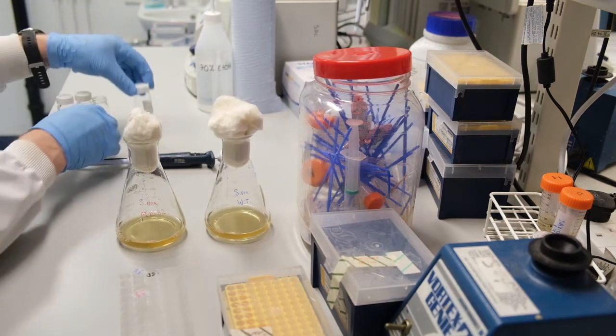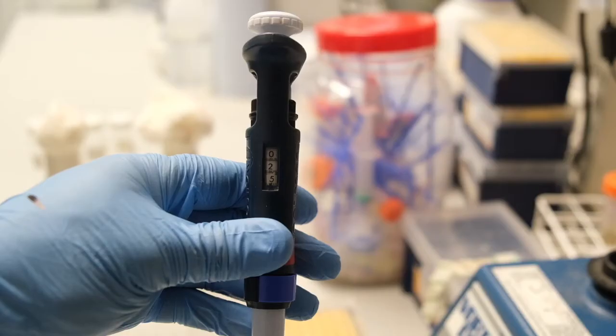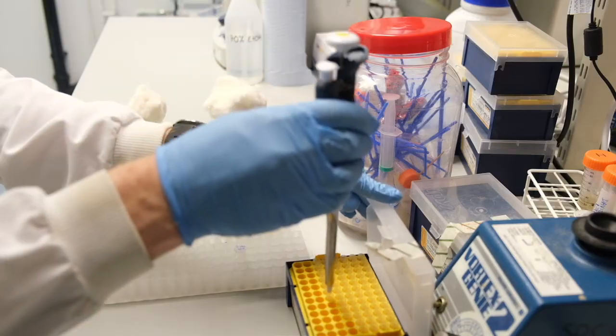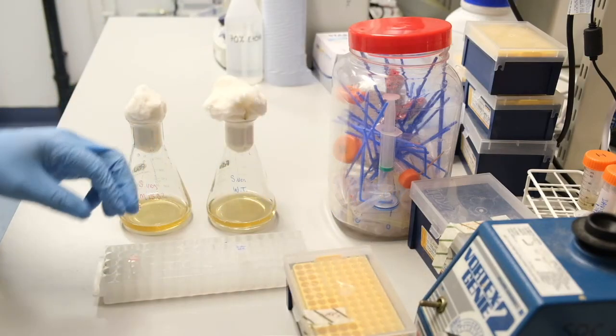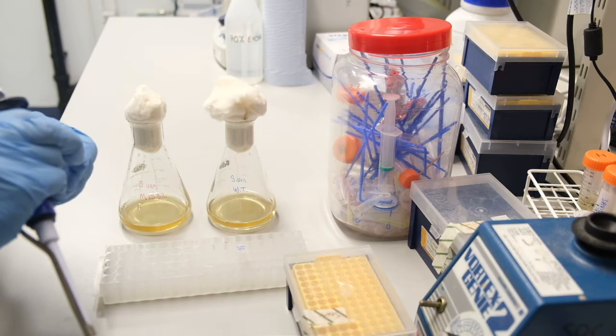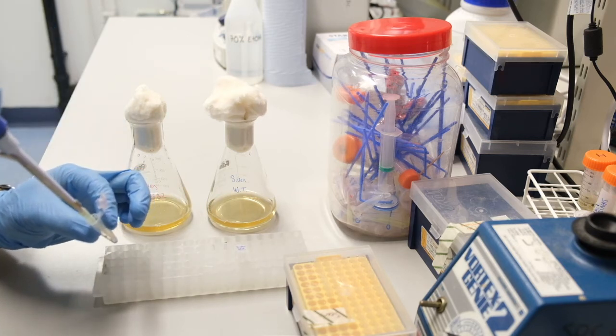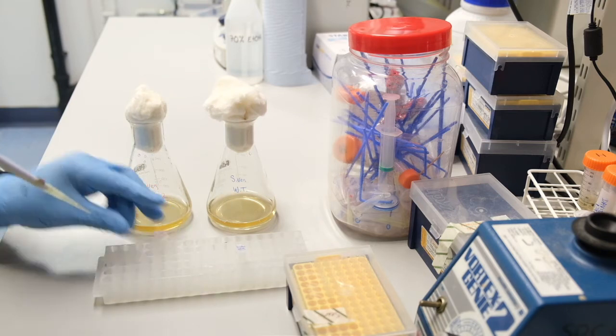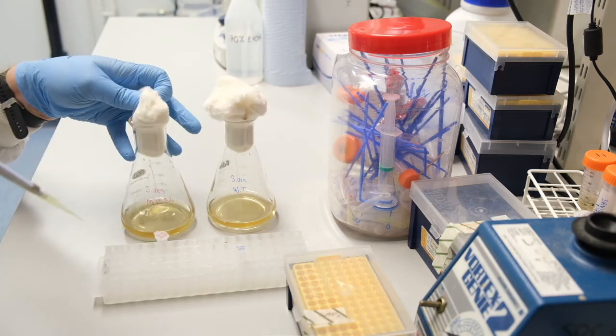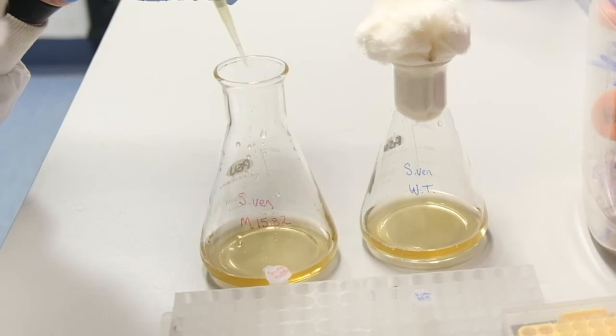I inoculate both cultures with 25 microliters of spore suspension using my original frozen spore stocks. Alternatively, I could have inoculated these cultures with our freshly prepared spore suspensions, or indeed I could have used a single colony from our nutrient agar plates.